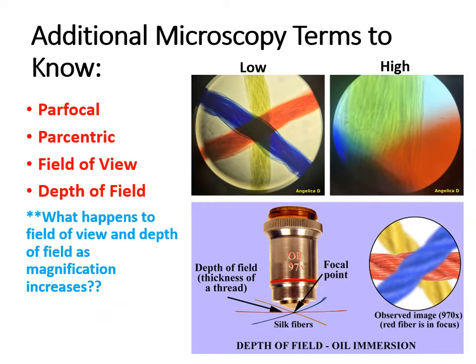You just use fine adjustment to kind of clarify the image a little, but it should stay in focus at all objectives.